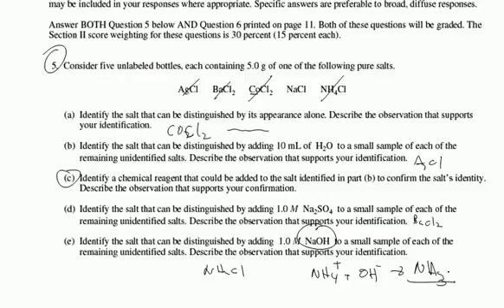Coming back to C, it asks, what could you add to confirm the identity of the AgCl? Okay, it turns out that if you add ammonia to AgCl, it dissolves it and it produces this weird kind of complex that looks like this. It's got an Ag, and then we're going to have 2 ammonias connected to it, and that thing is going to have a plus charge, and what's also going to happen is that Cl is going to get kicked out.